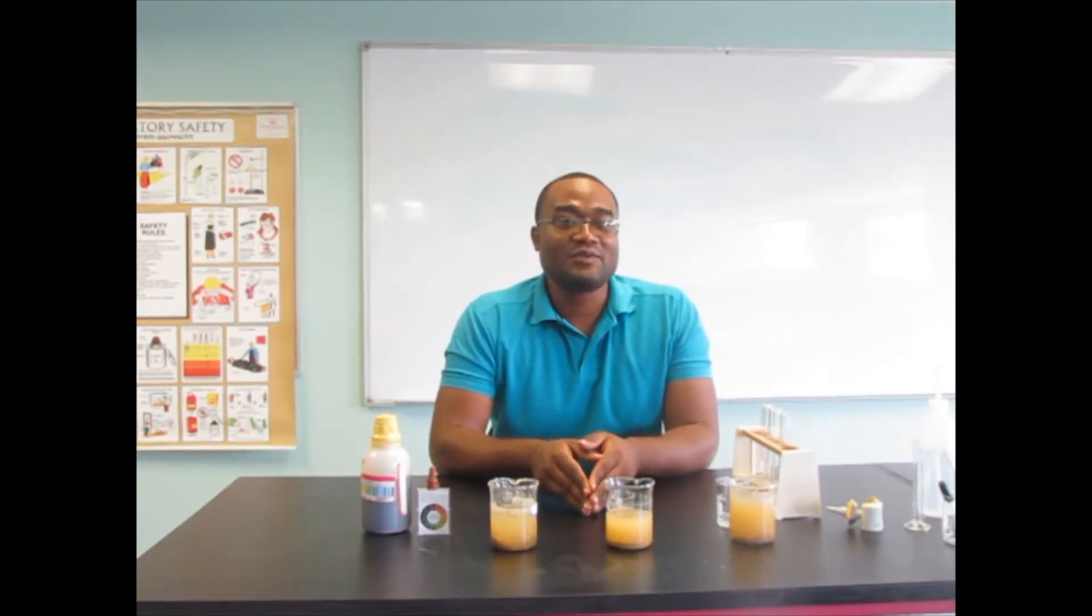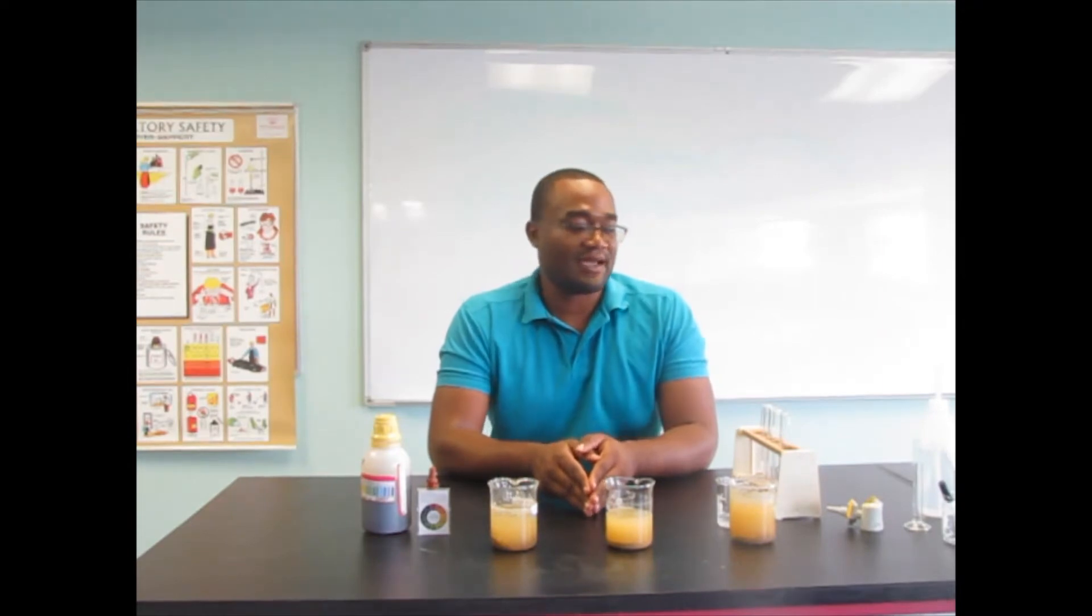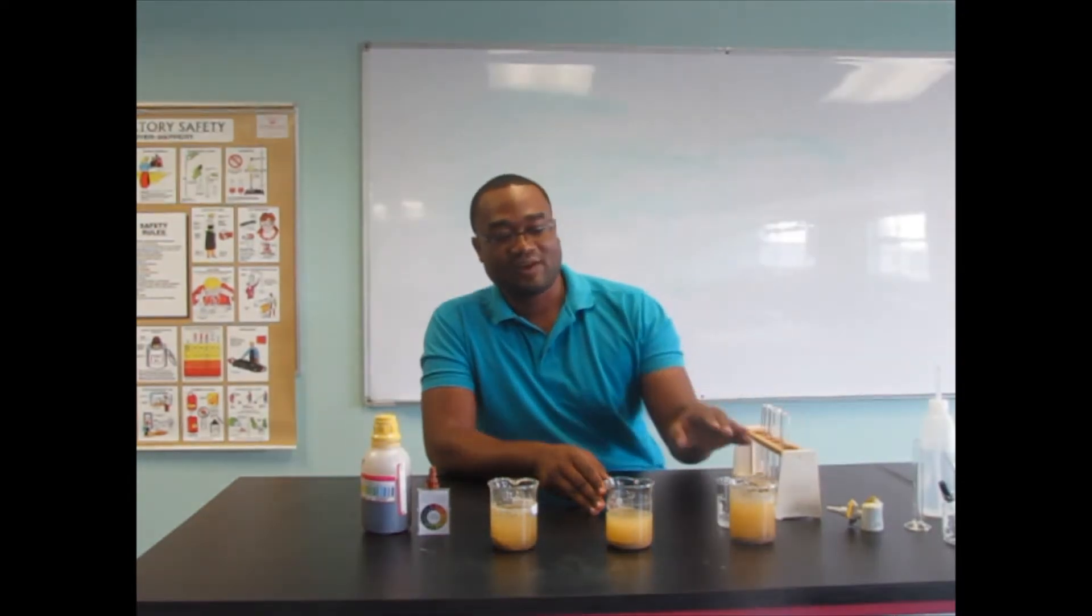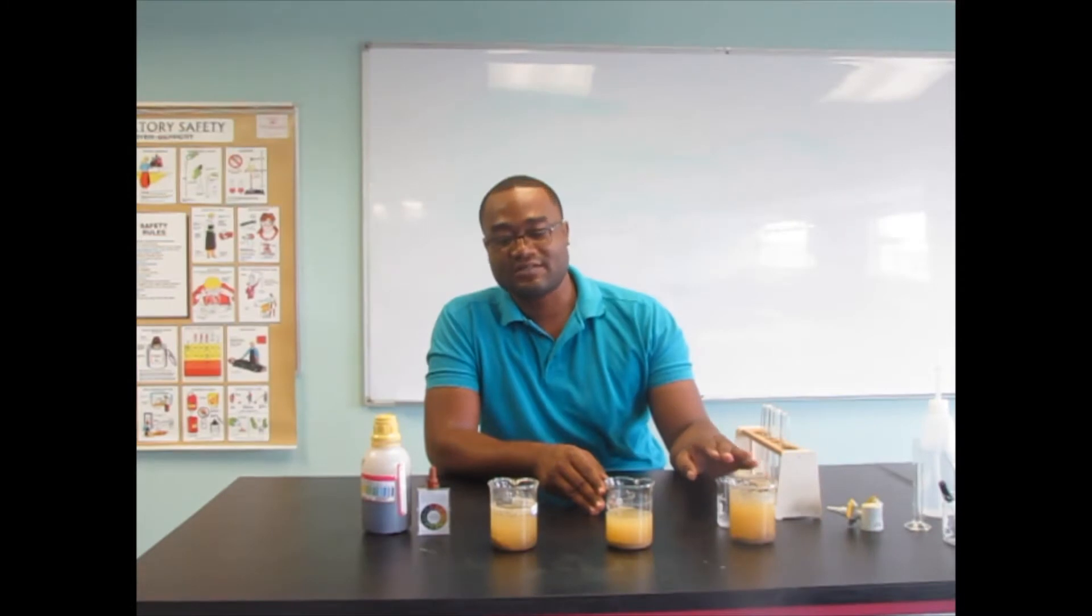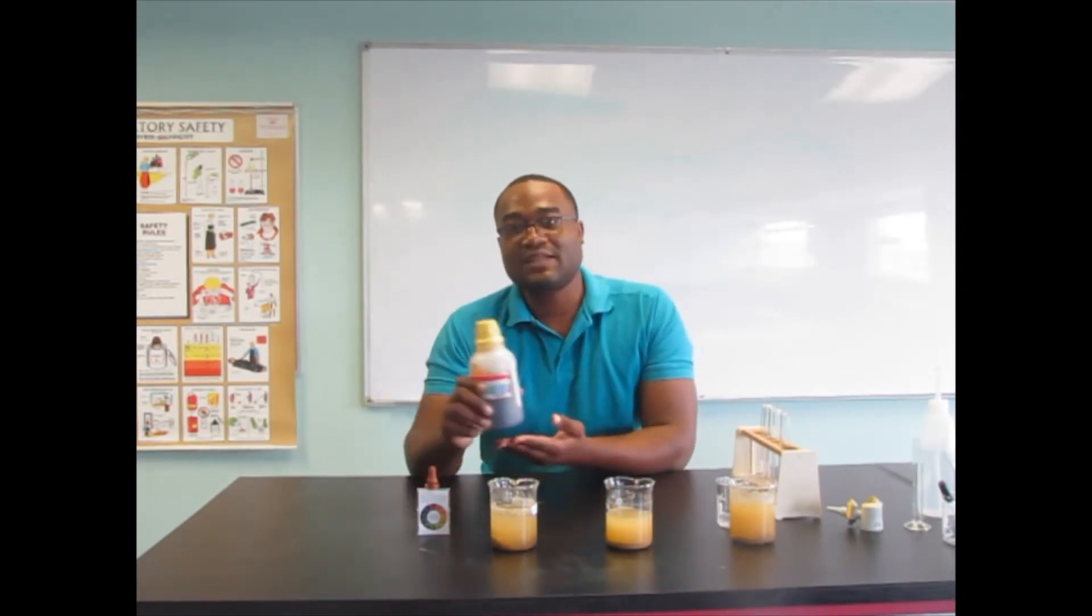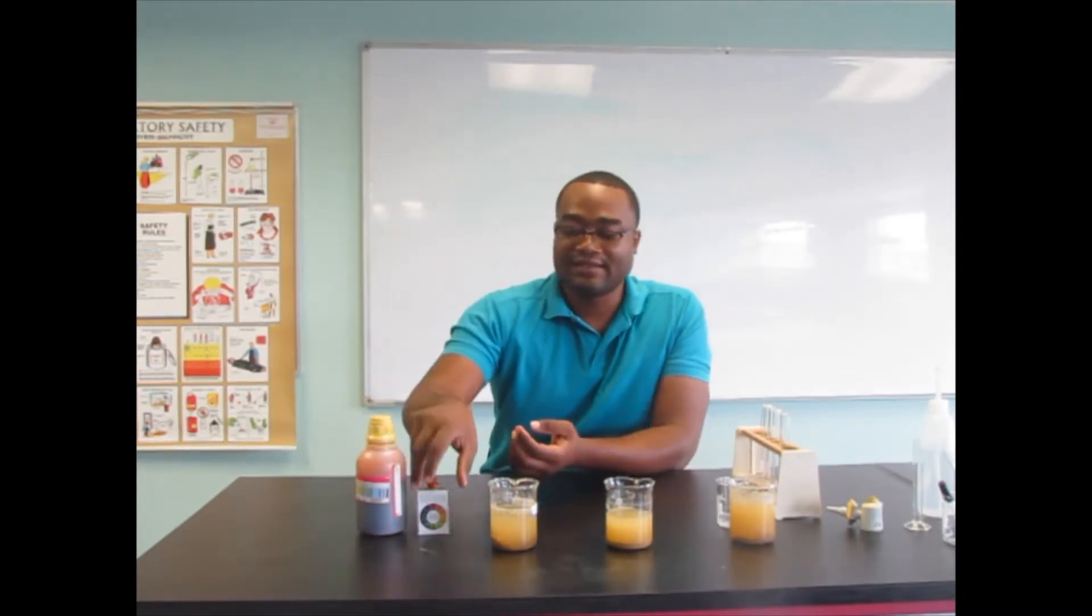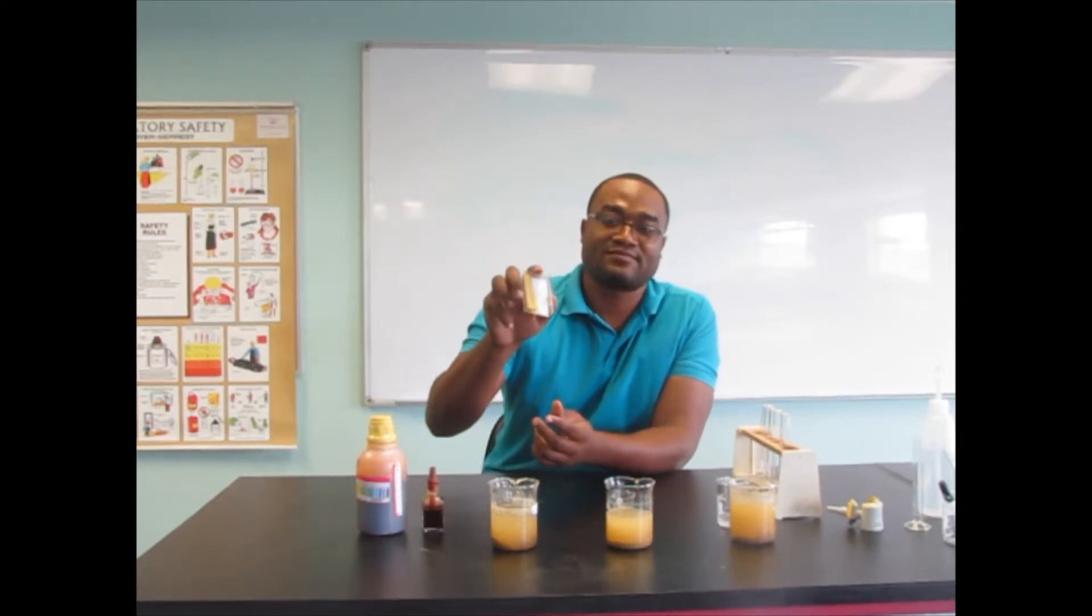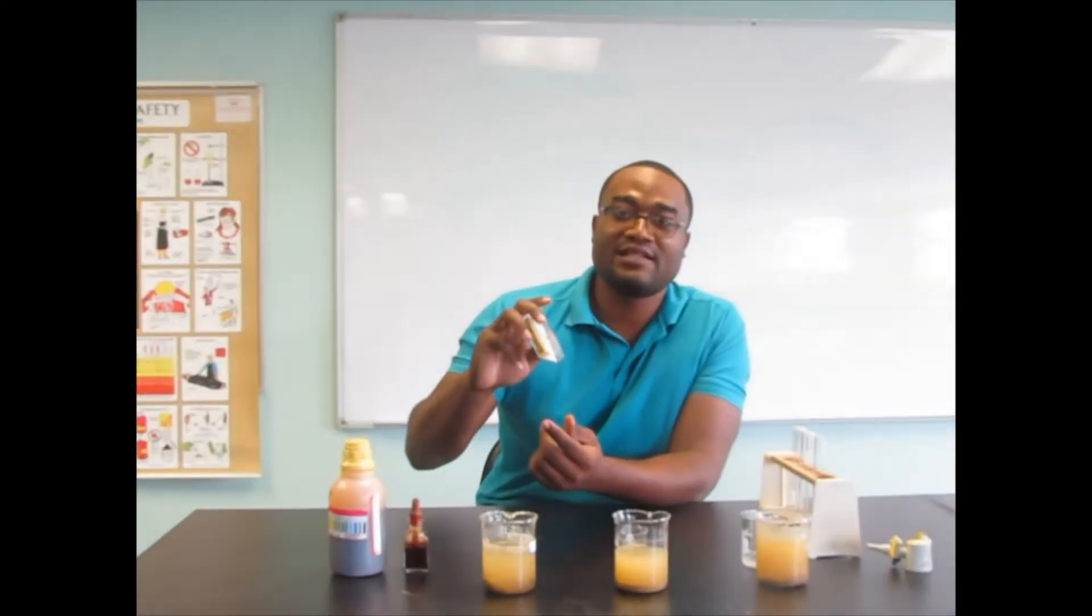What we are going to need to do our pH test are our test tubes, our beakers with soil solutions, the universal liquid indicator and the litmus strips. This is also a universal indicator as well.